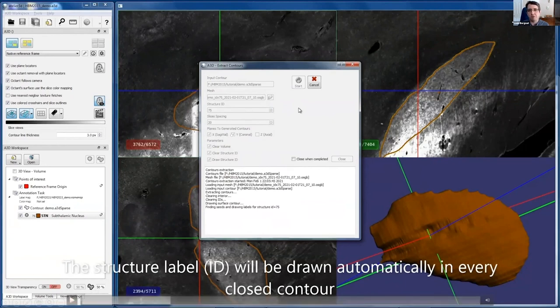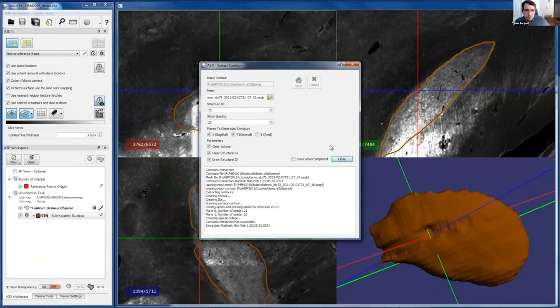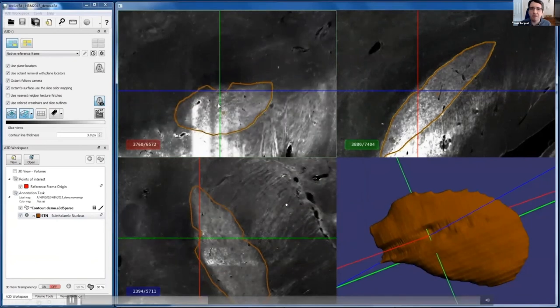This time, however, we'll want to have annotation not only on the coronal, but also on the sagittal axis, so we can refine our work doing drawings on both sides. Continuing. So I'm not sure how well it shows on everybody's screen.